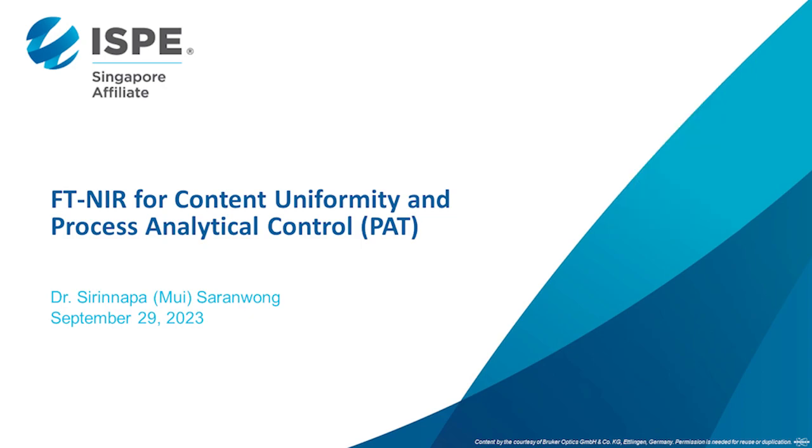All right, today I will talk about 2 things. Of course, NIR also can do identification like FT-IR and Raman, but our focus today is on the quality control, which is the content uniformity, and the process control, or what we so-called PAT, Process Analytical Technologies.